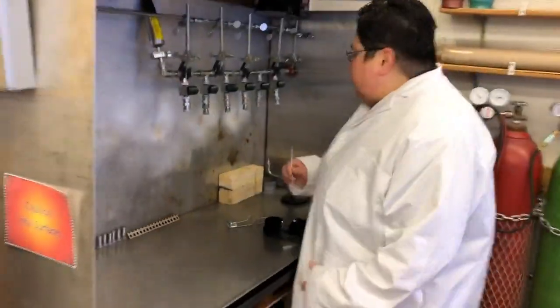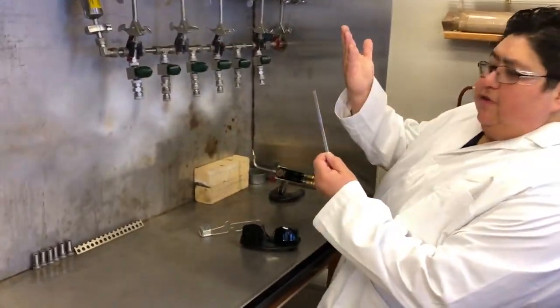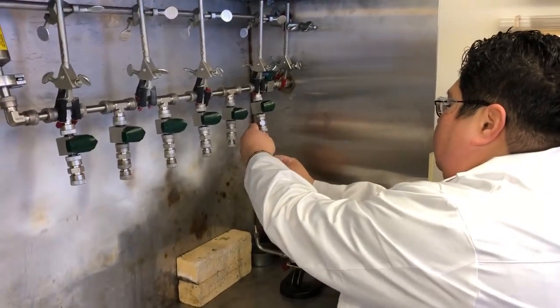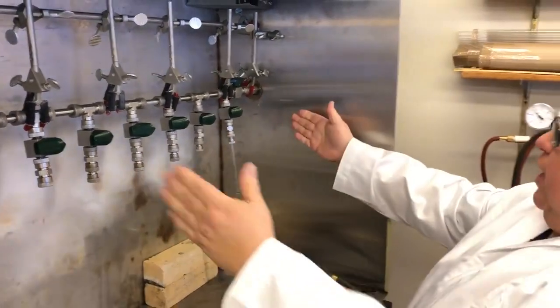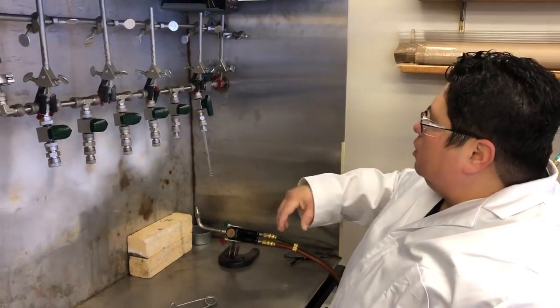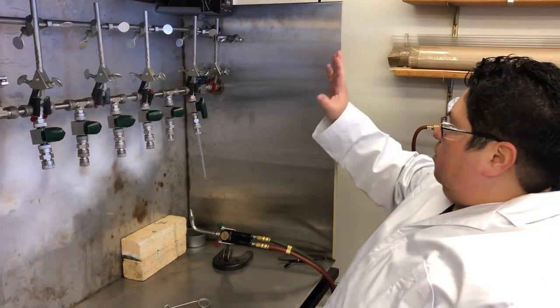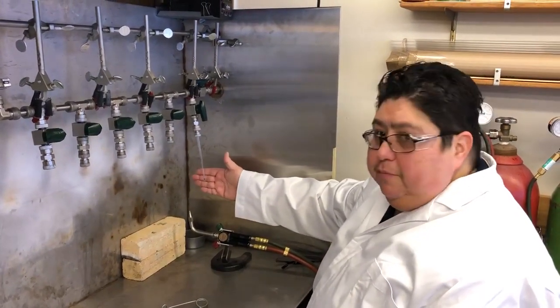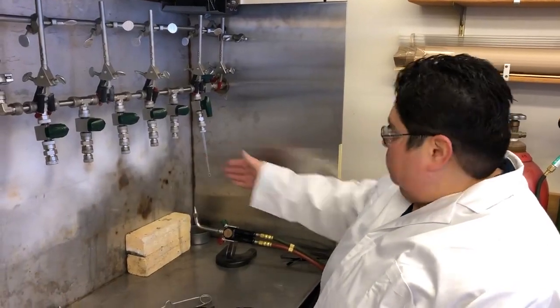All right, excuse my back. Okay, so I've got obviously air in the sample. So the first thing I need to do is put this onto my vacuum line and expose it to vacuum. This is going to pull all of the air that's in there out and create a nice little vacuum so that the only thing in here is the sample and its oxygen source.